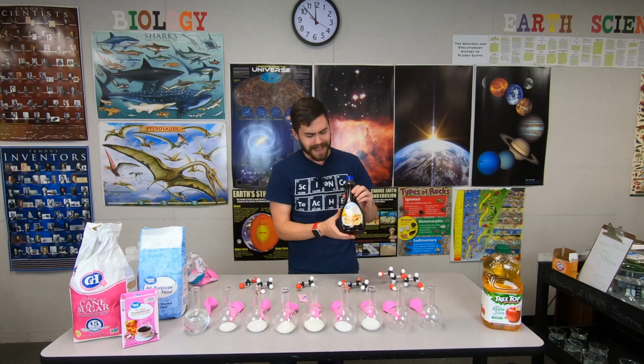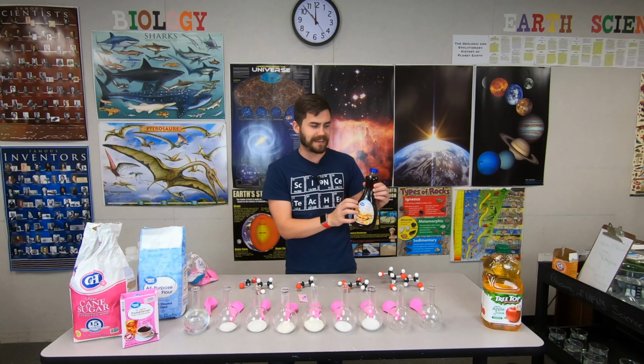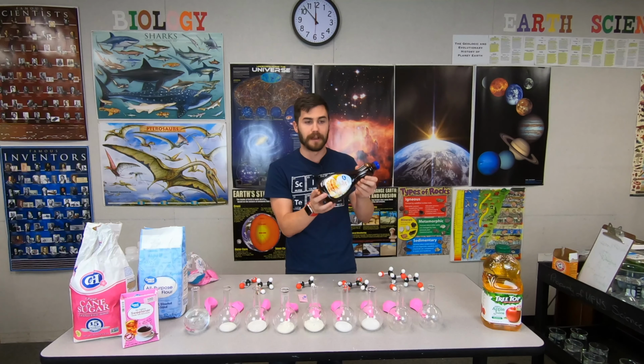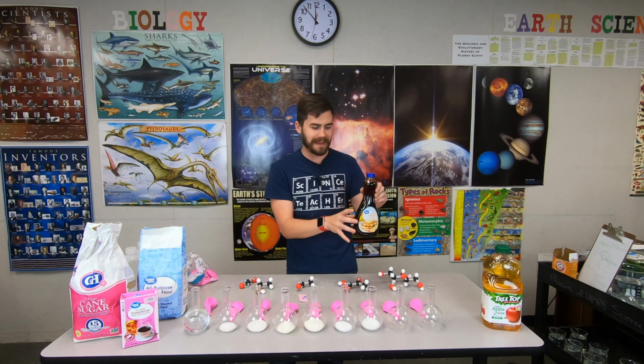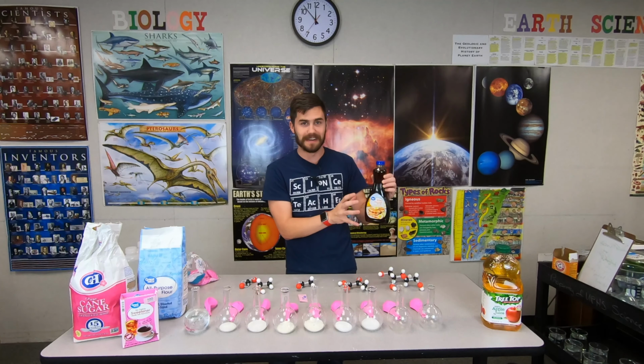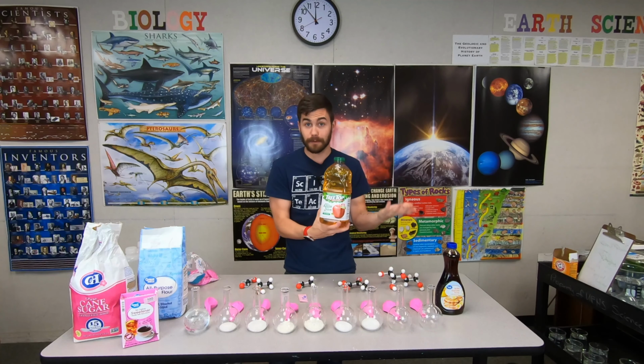I don't know how successfully the yeast will be able to break that down, and even if they do, I don't know how successfully the carbon dioxide gas will be able to get out. Now, this is cheap, really runny syrup, so I'm hoping that it gets a pretty wild, or at least pretty unique reaction. The final one is going to have apple juice in it.